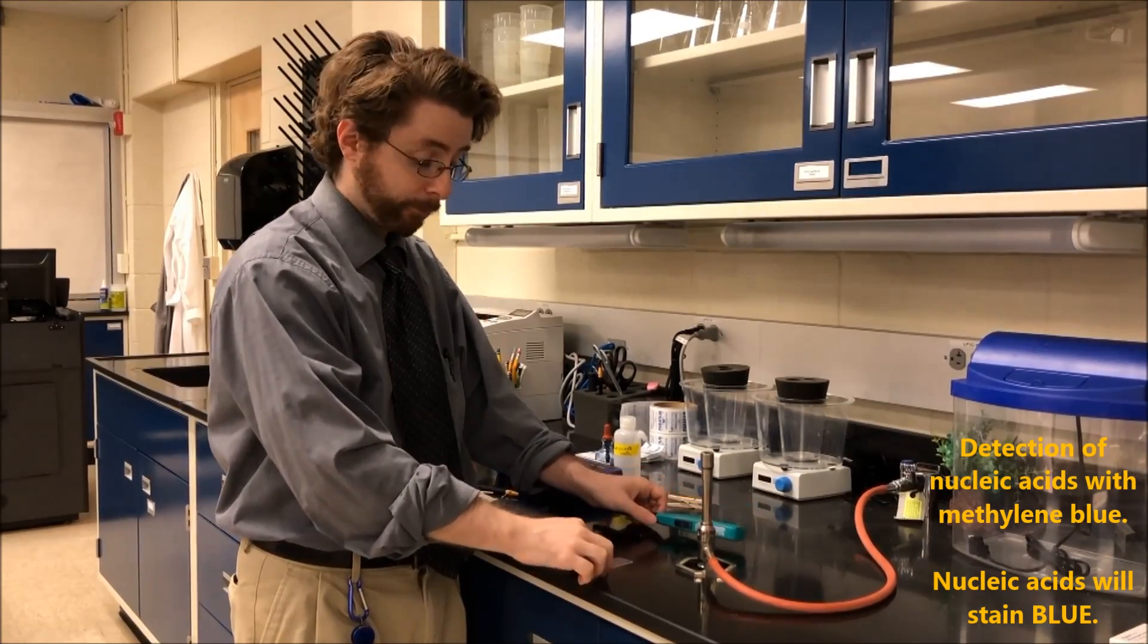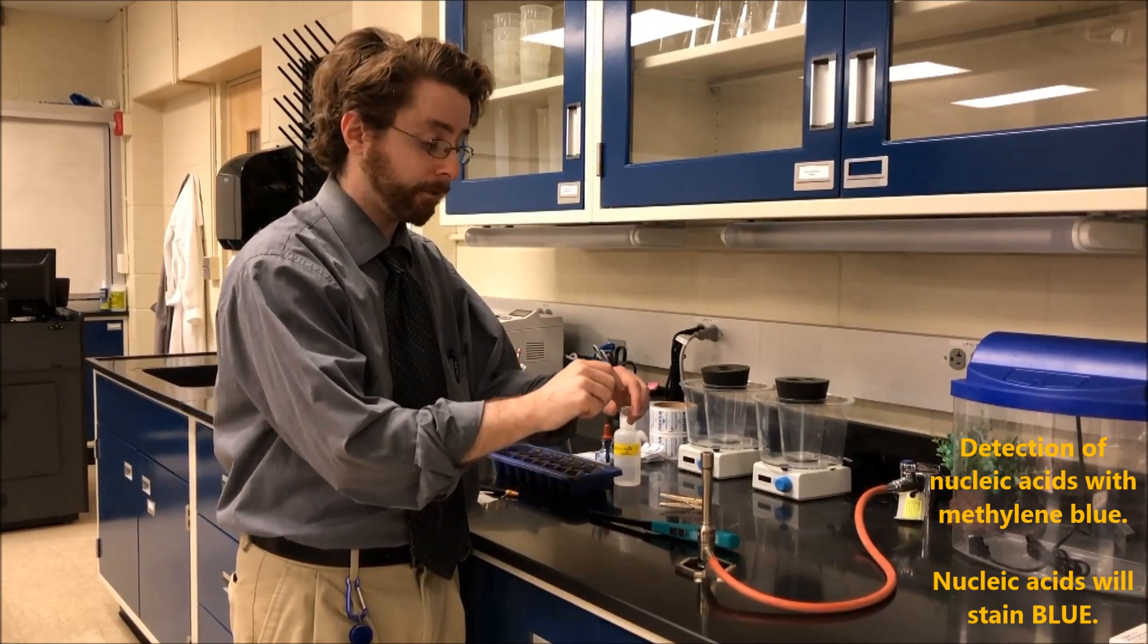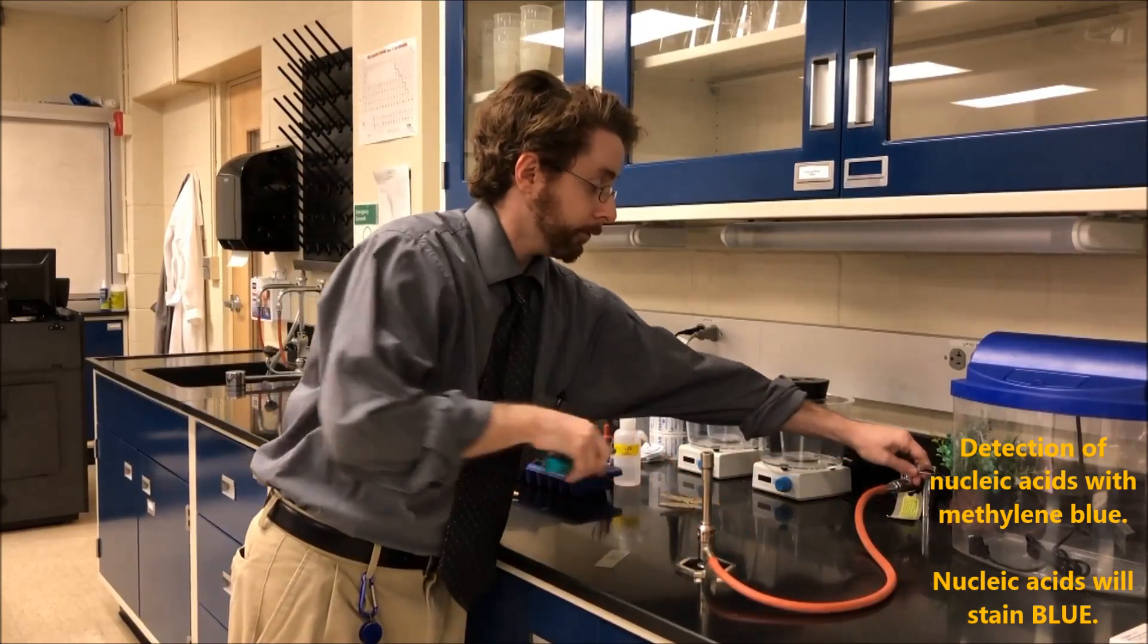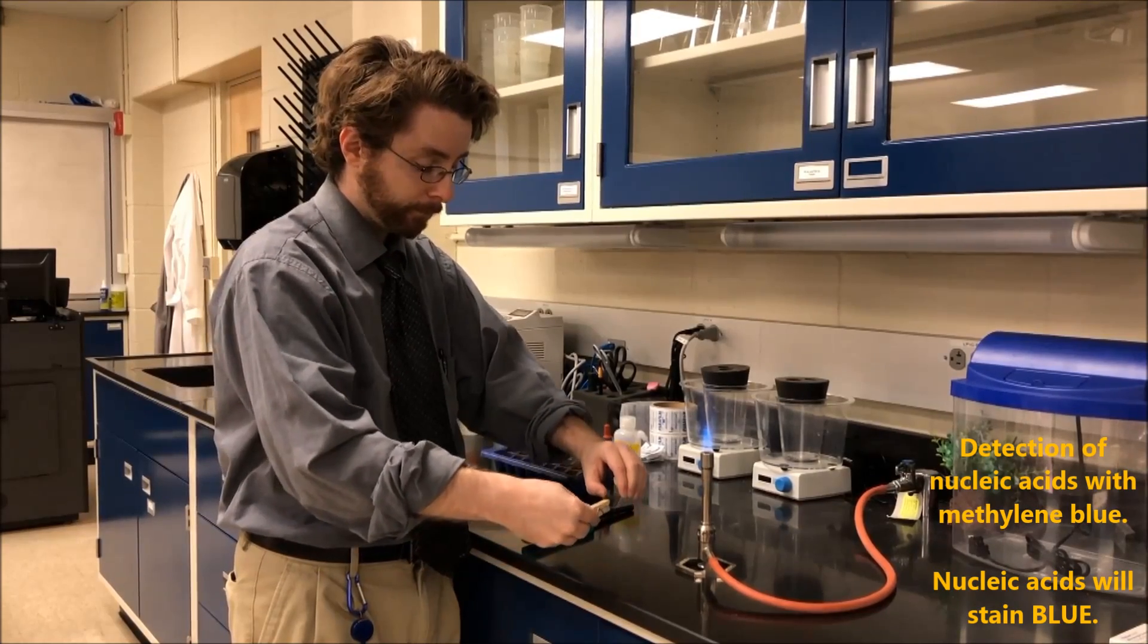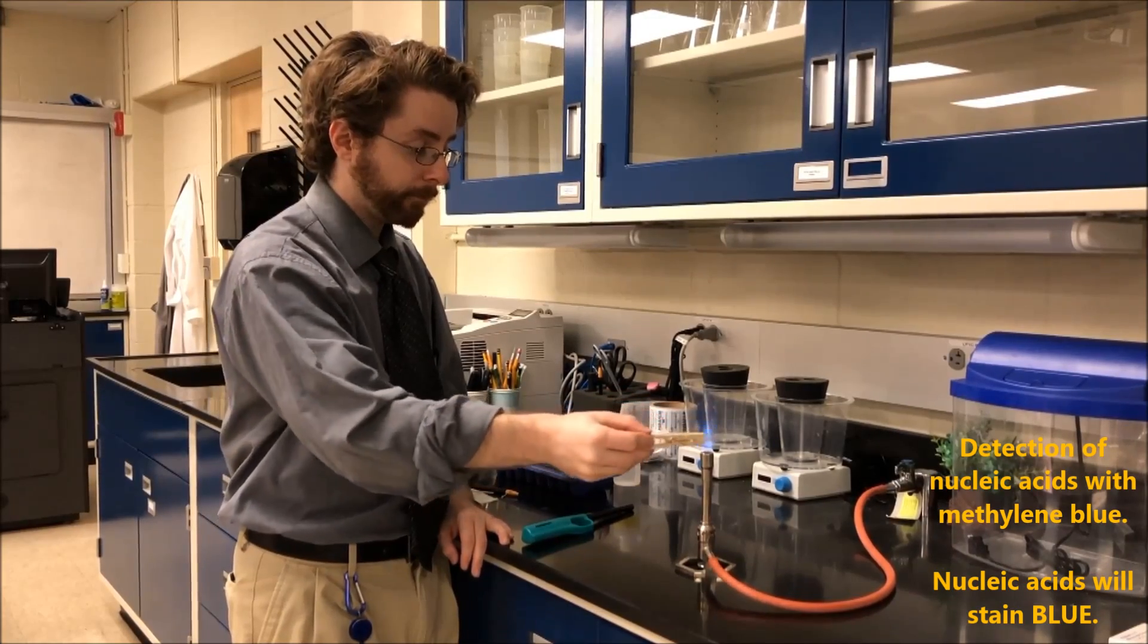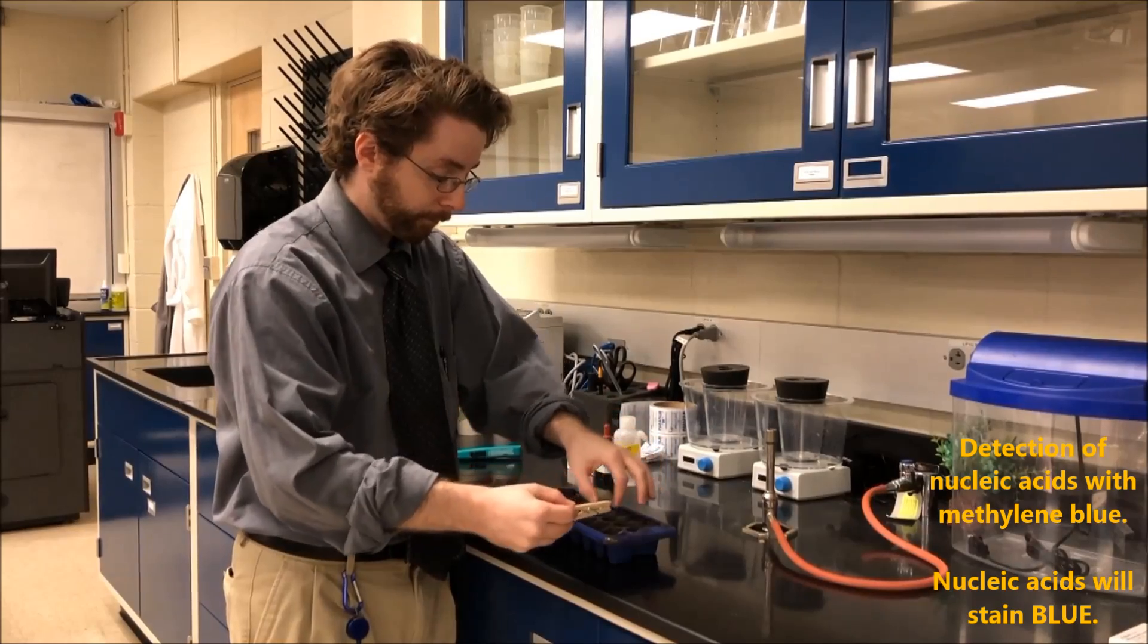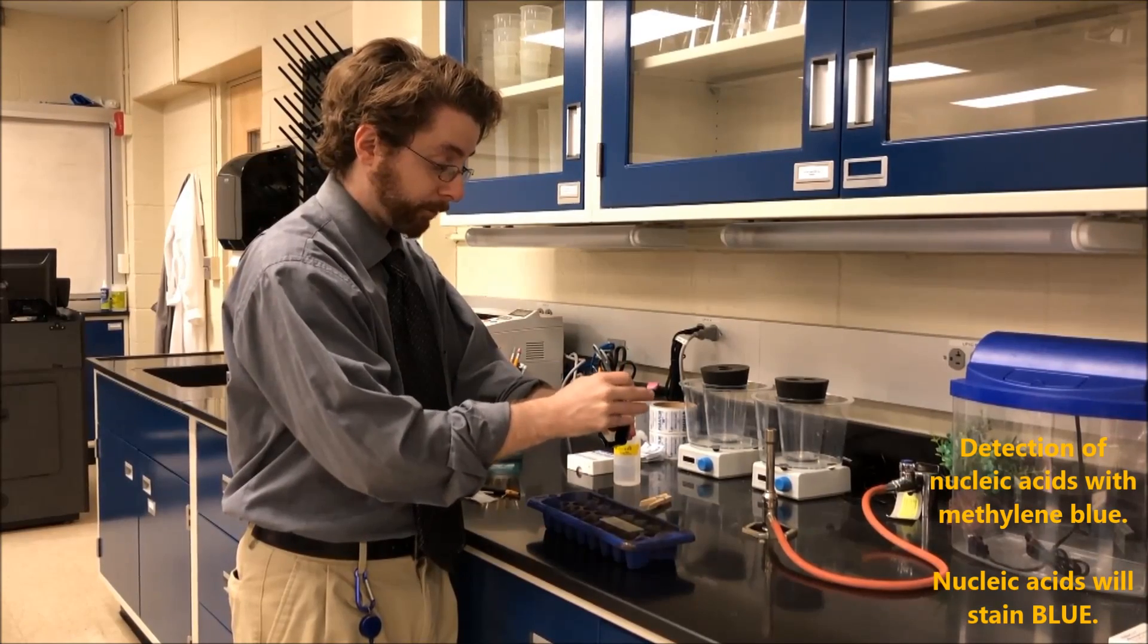And then we're going to heat fix it. So we're going to pass this slide through the Bunsen burner that's going to remove the water and fix the cells to the slide such that when I add the stain, the cells won't rinse off. So I'll turn on my gas, take my clothespin, and I'm going to pass it through the flame three times. Once. Twice. Thrice. I'm going to put my slide onto the staining tray, and then I'm going to add a few drops of methylene blue.